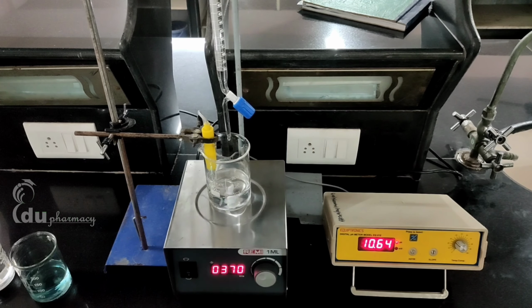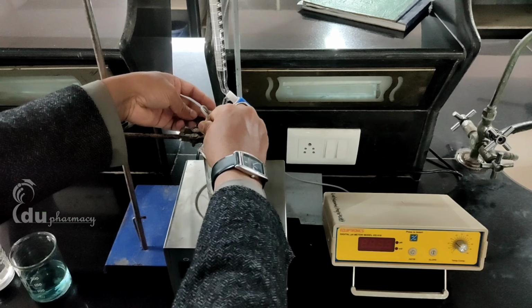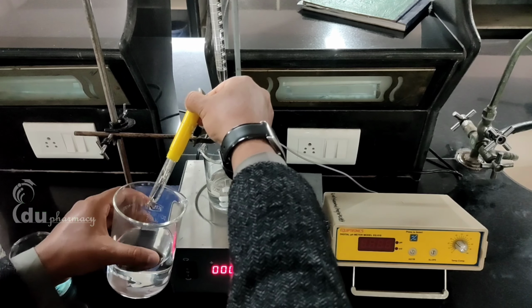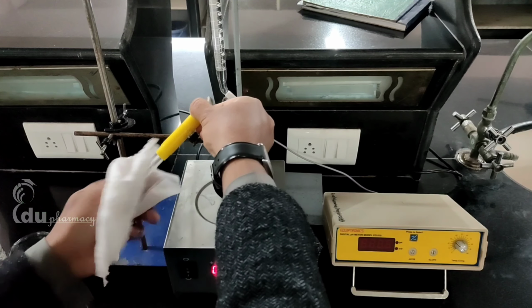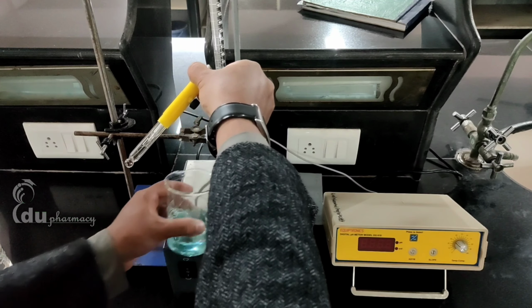Here, I have completed 10 readings of the glycine solution. Now we must replace the glycine solution with the complex solution. Before placing the complex solution, I must wash the pH electrode with distilled water and wipe it with tissue paper to clean it properly. Now it's time to take a complex solution into the beaker.